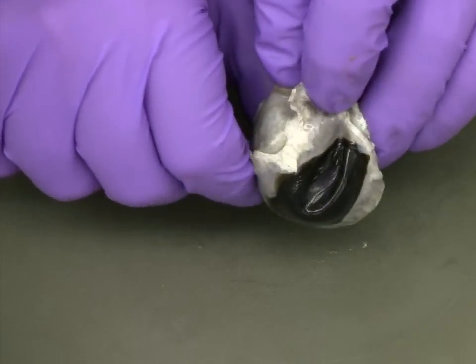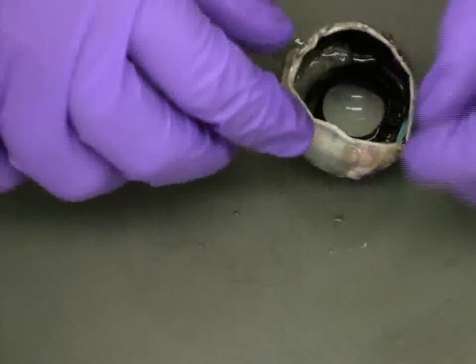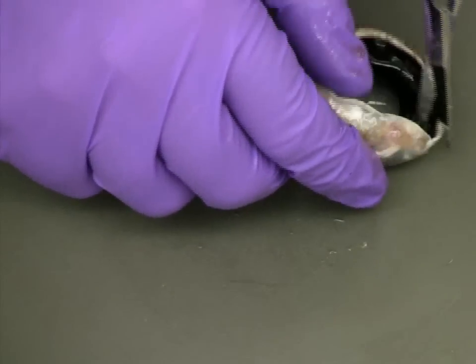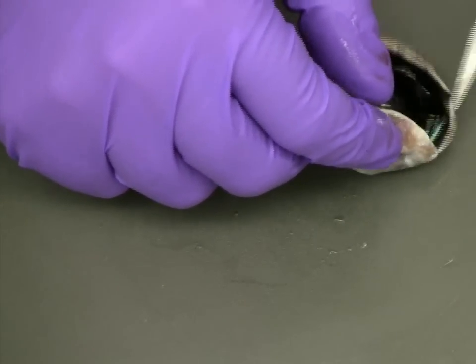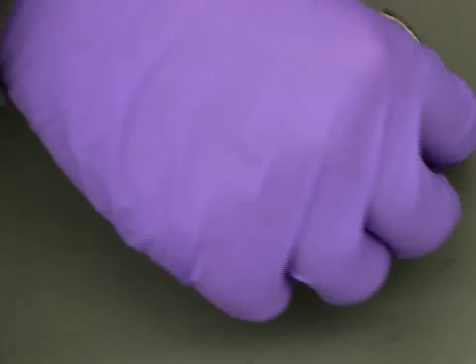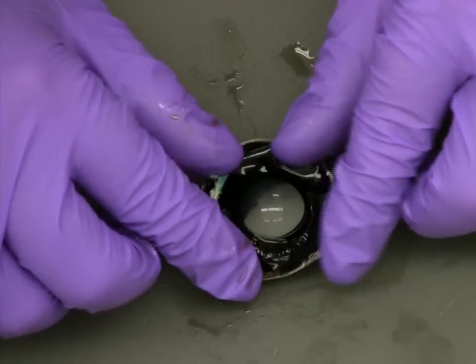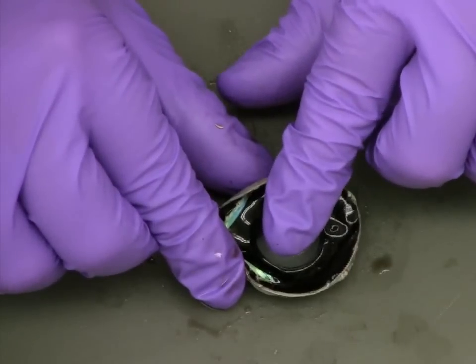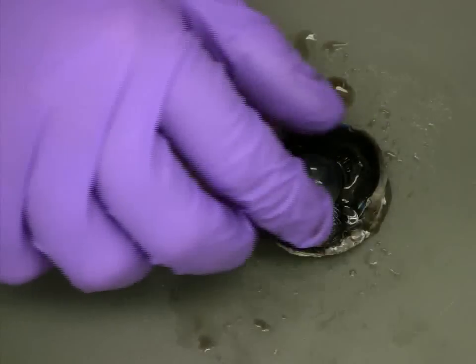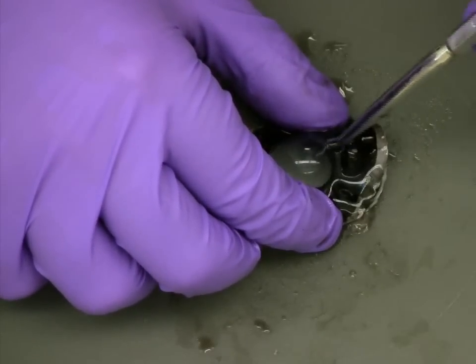We can also see the iris by flipping over the eye and looking through the clear cornea. Before removing the lens, trim any extra sclera from around the iris. Now the lens should be clearly visible. One of the first things to note when examining the lens is that it is very flexible. To remove the lens, carefully use your blunt probe to slowly break the fiber connections between the lens and the iris.